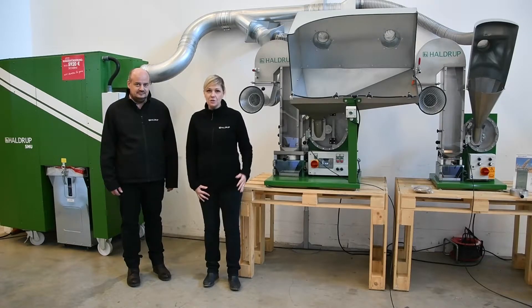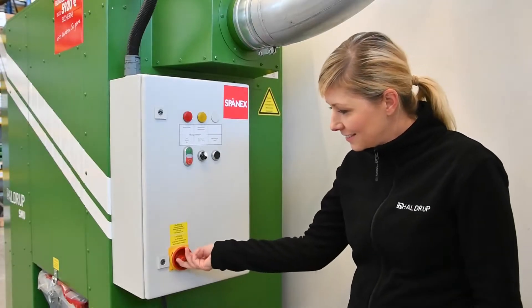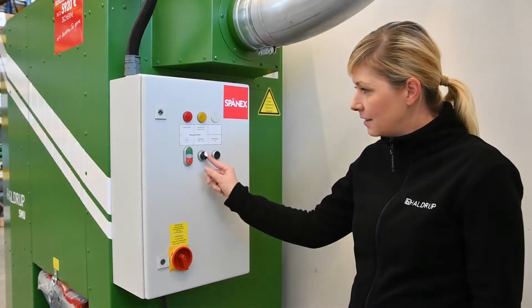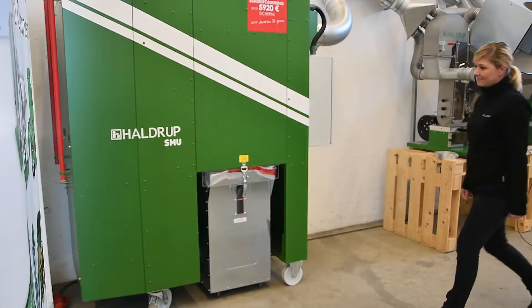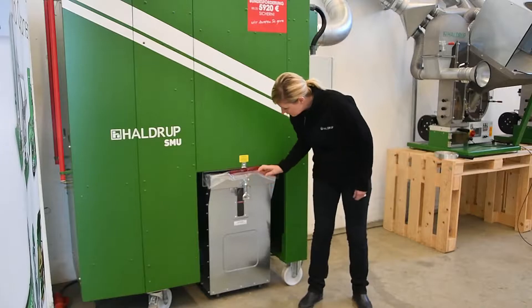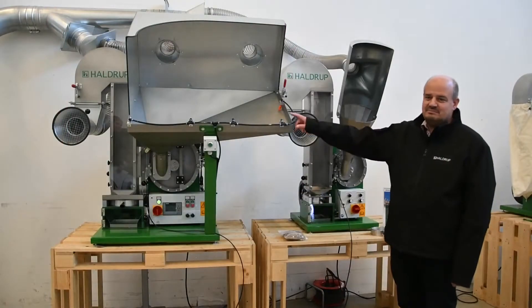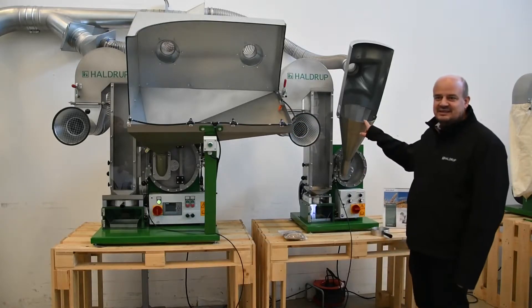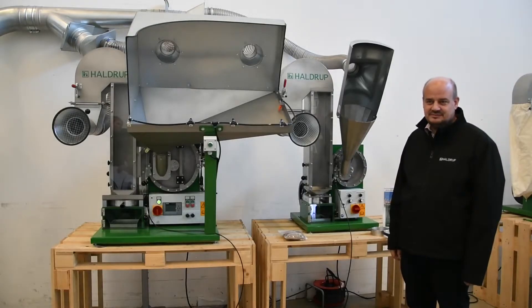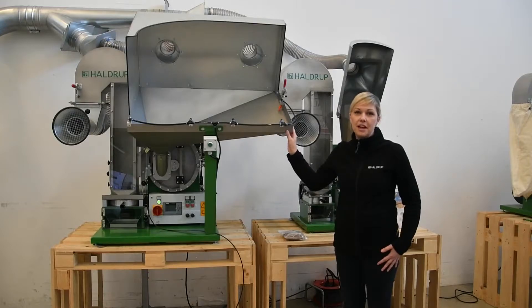Here we have it connected to our laboratory threshers, the HALDRUP LT20 and LT15, and we will use the dust extractor while using these two machines. The HALDRUP LT20, together with our HALDRUP LT15, represents our options for single-plant threshers. The HALDRUP LT20 is equipped with a large feeding funnel which is suitable for threshing plants with large stalks.